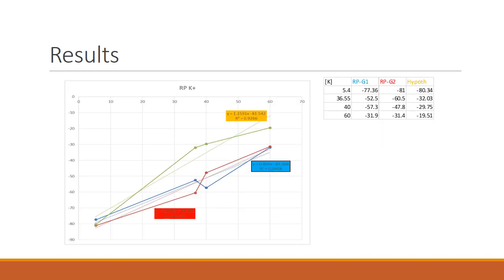This graph depicts a linear change in RP examined by our groups as the extracellular potassium concentration was increased in the solution. There was a positive linear change in resting membrane potential as the potassium concentration was increased, as can be seen in the graph. In addition, a line was calculated for the values that should have been hypothetically calculated based on the Nernst equation.